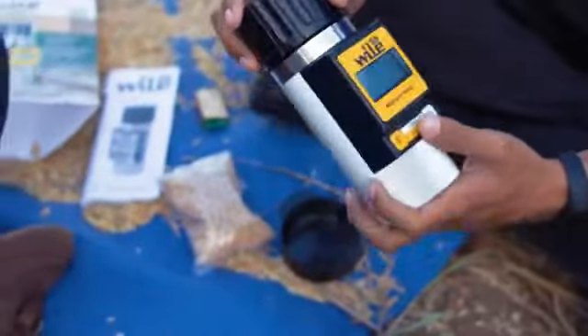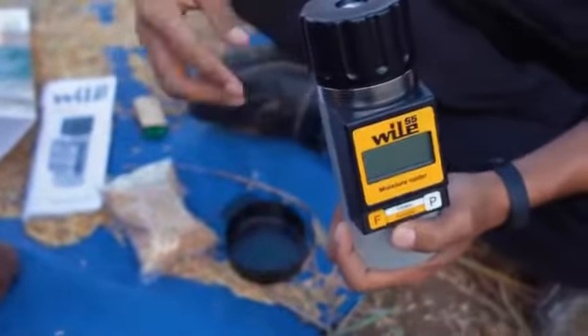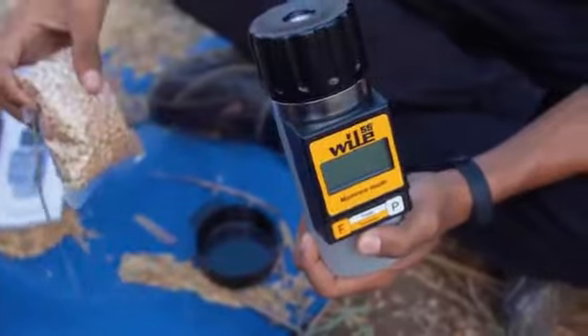Selanjutnya kita akan menguji kadar air pada biji gedele.